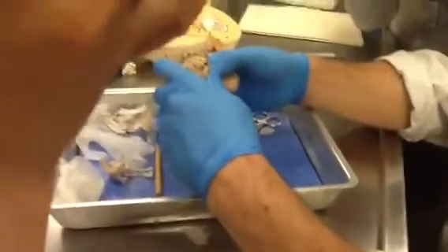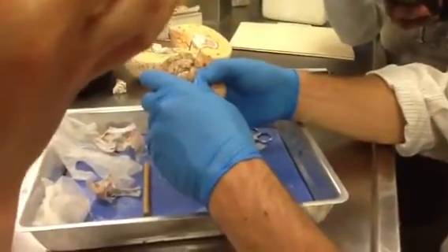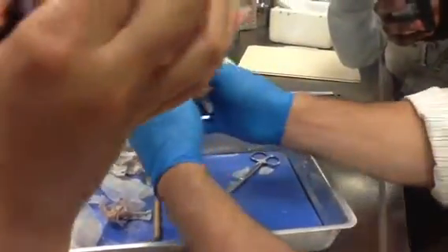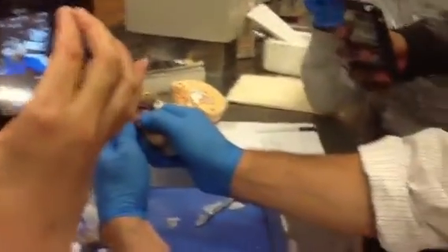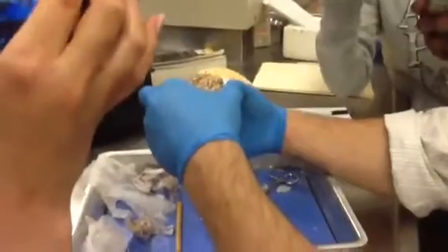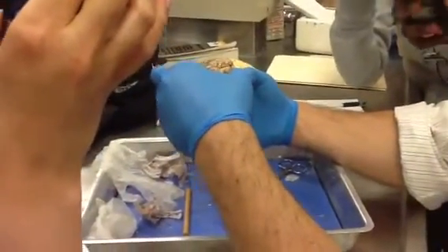And then if you retract it even further, look right above the butt there. You see that little structure in there? That is the pineal gland. Okay, you see it there? That's the pineal gland. Everybody got that? You see it up there? Above my thumb up there? Okay, all the way on top, the pineal gland.